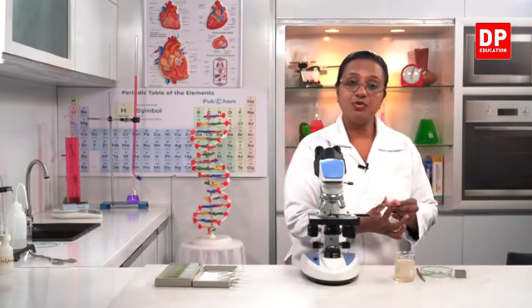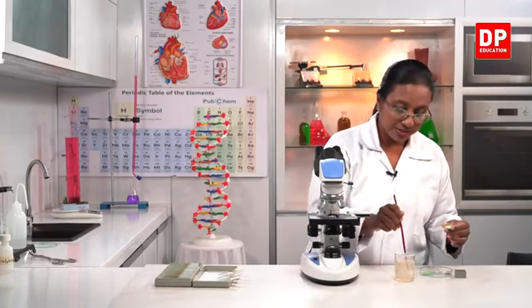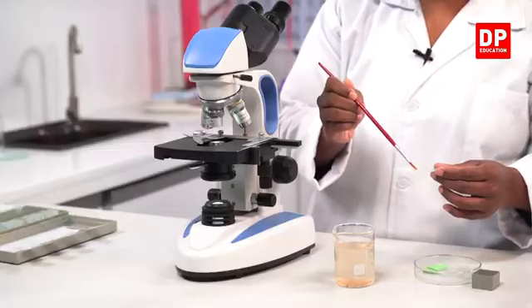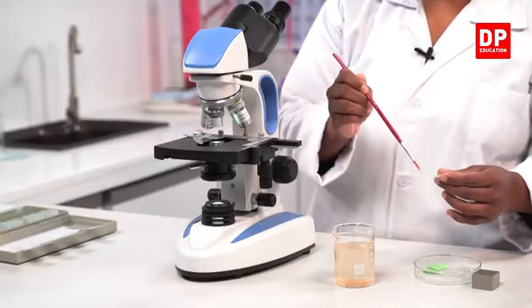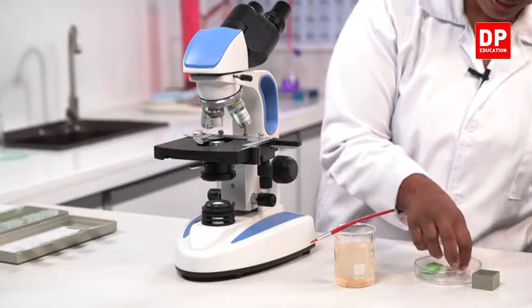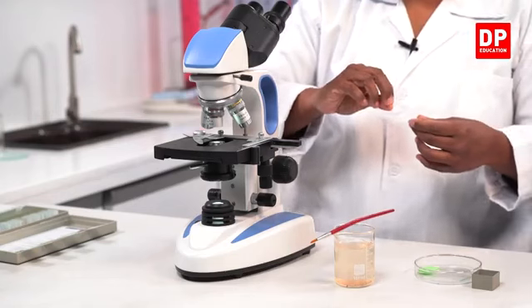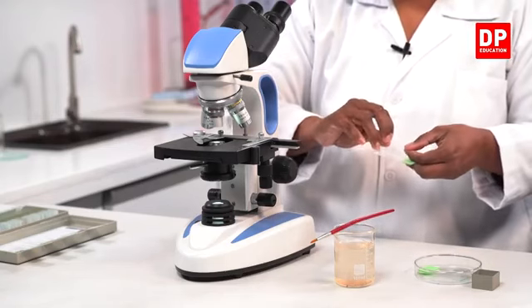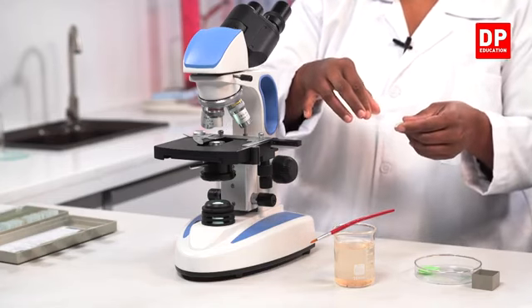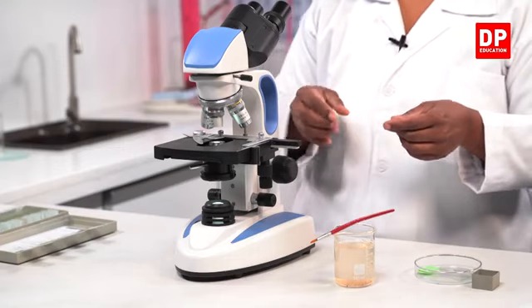For that, as you all know, we need a very clean glass slide, a paintbrush to transfer the solution. So here it is pond water. So I take 1 or 2 drops of pond water, and this has to be covered with a cover slip. And when we cover it with a cover slip, we have to make sure that air bubbles don't get trapped inside. So to do that, you all know the method. Keep it slant and place it on the sample.